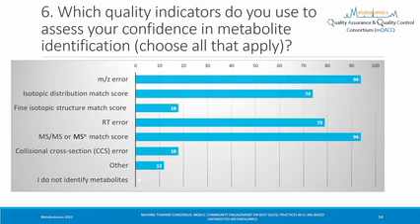They're using retention time, they're using the MSMS match score, and they're using the isotopic distribution. By that we mean, for example, the M and M+1 peak and the intensity ratio of those to define how many carbon atoms are present in the molecular formula. Some people are also using the fine isotopic structure, looking for specific atoms, for example between 32 and 34 sulfur, 35 and 37 chlorine, etc.